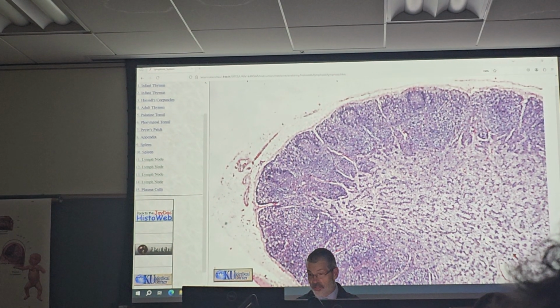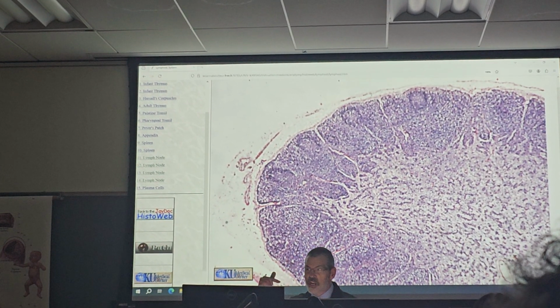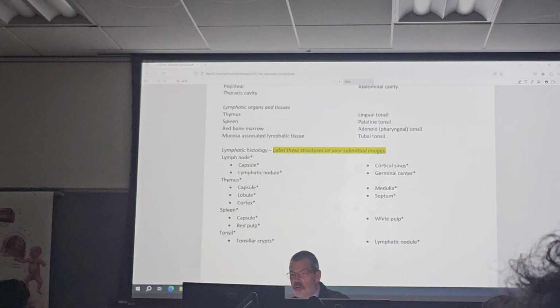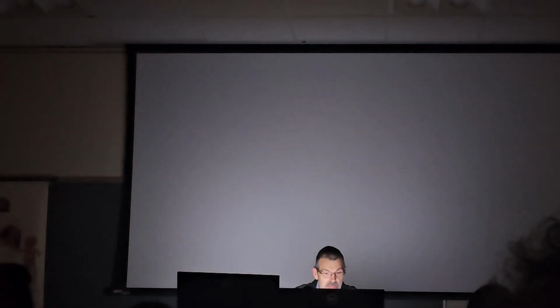Okay. So now what you're going to do is remember where the darkness is, right? Because that's going to change on the next slide. So what's our next part we're supposed to learn? Let's see. We're supposed to learn a thymus. Okay. Let me hit you with a thymus. You're going to see one, I hope, big difference. If not, that's why I'm here.